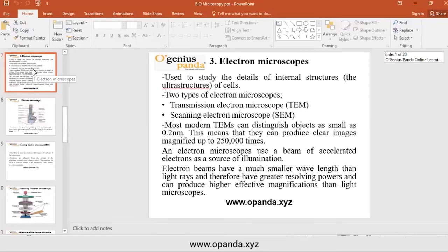Let's look at the electron microscopes. Electron microscopes are now replacing the compound light microscopes, because what you are familiar with are compound light microscopes. I mentioned those in our school. Electron microscopes are rarely found here in Rwanda. I never found one. It is a matter of the progress and development of the country. It may be there, but I've never been lucky to see it.